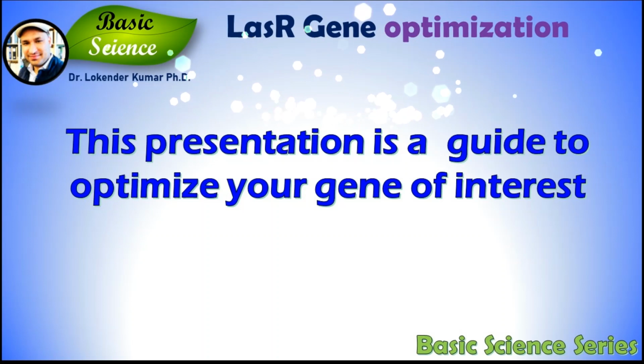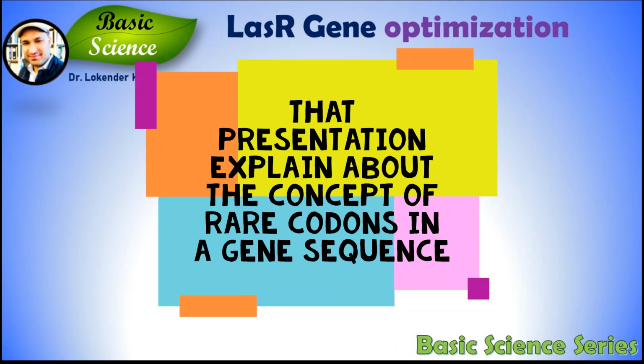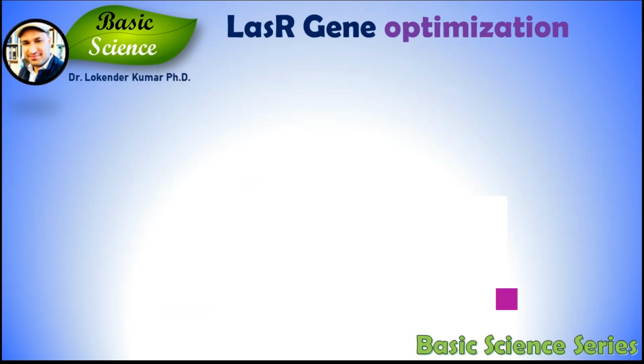You can use this as a guide to optimize your gene of interest. Before starting this presentation, please watch my previous presentation on the basic concepts of gene optimization. That episode will explain the need of gene optimization during protein purification. That presentation explains in detail the concepts of rare codon in a gene sequence.